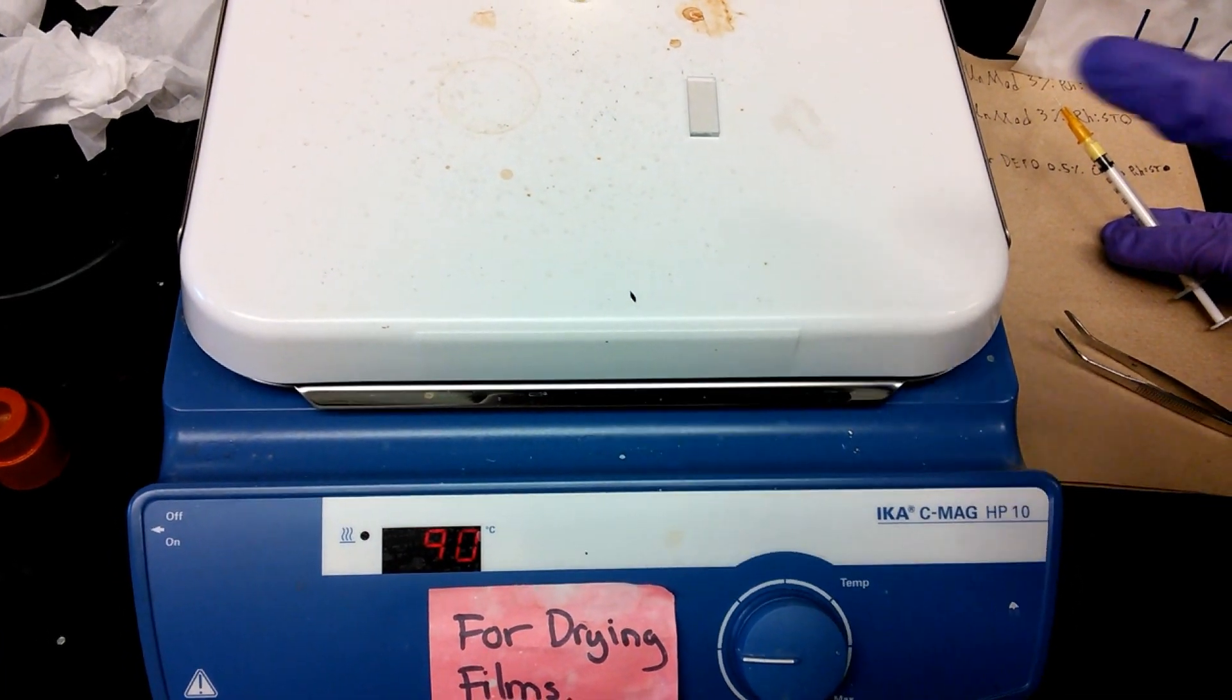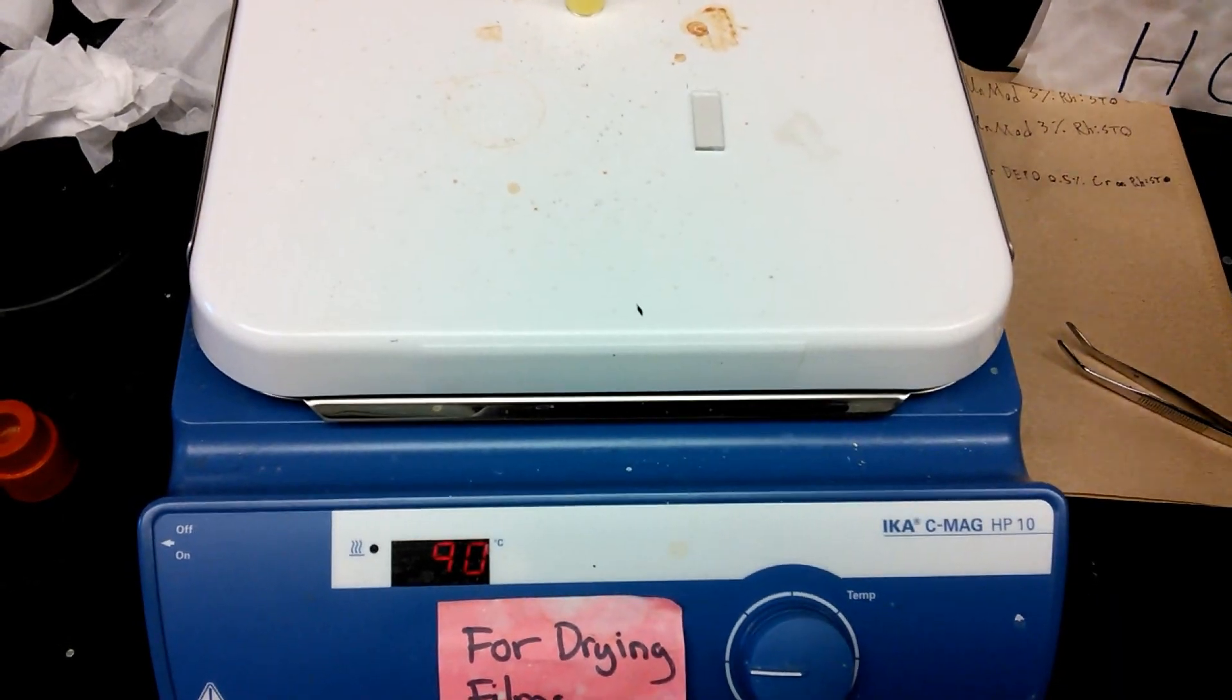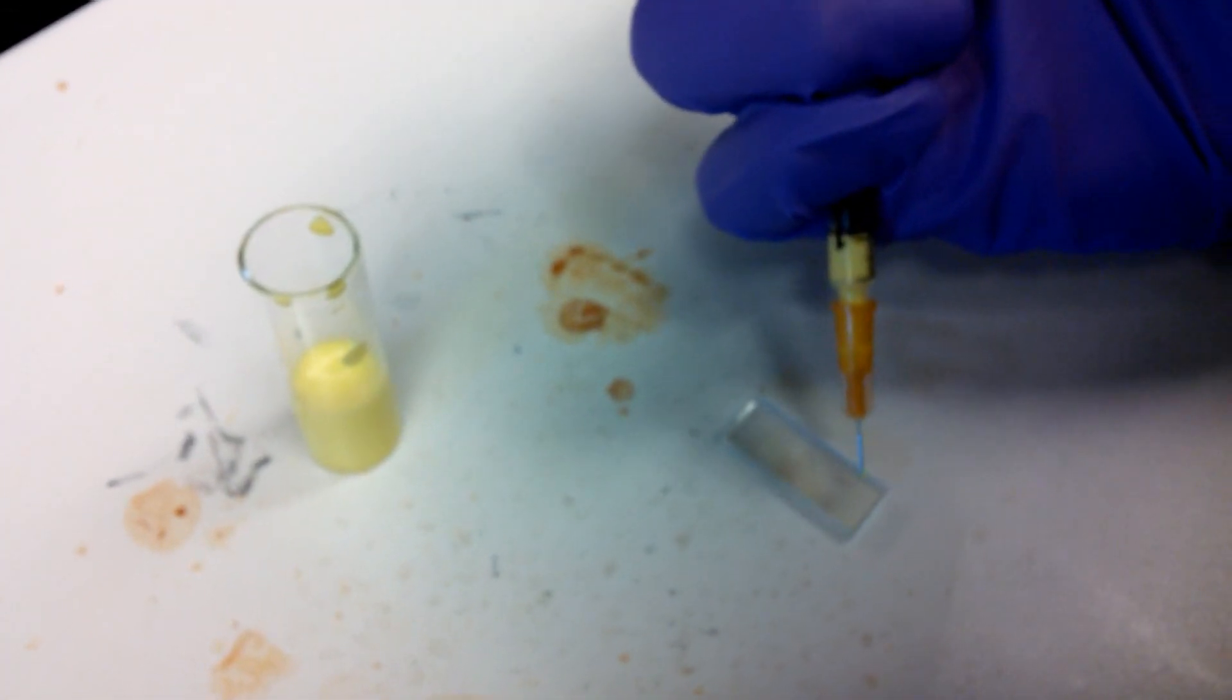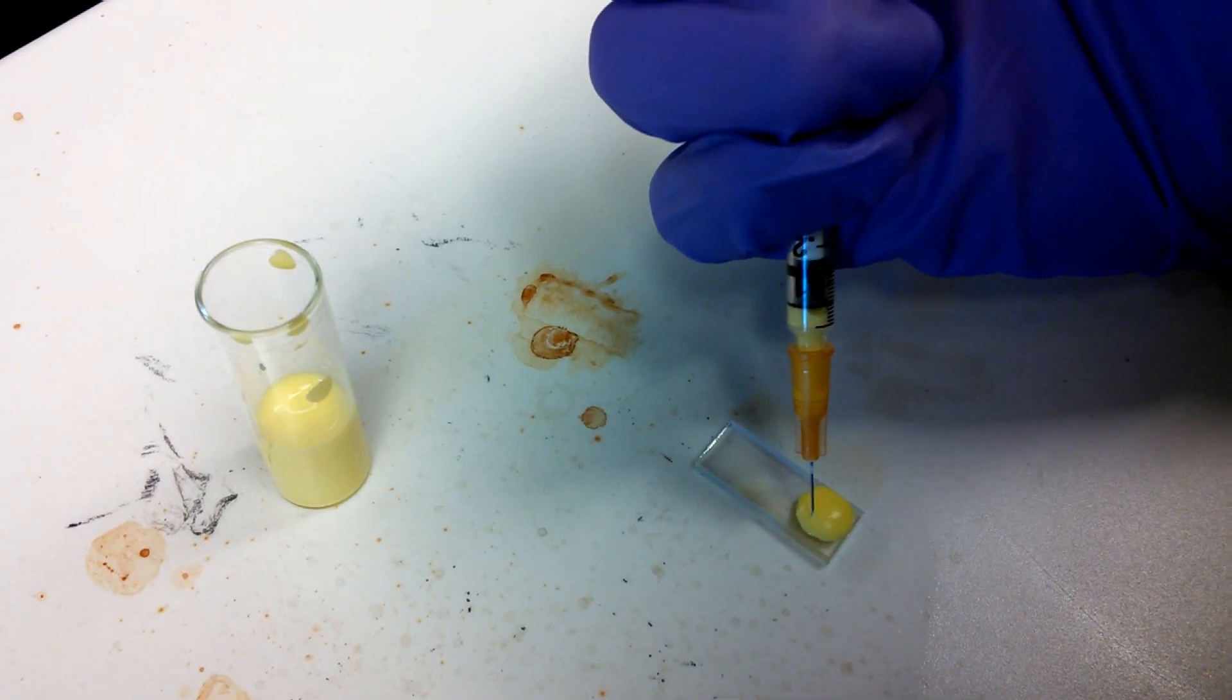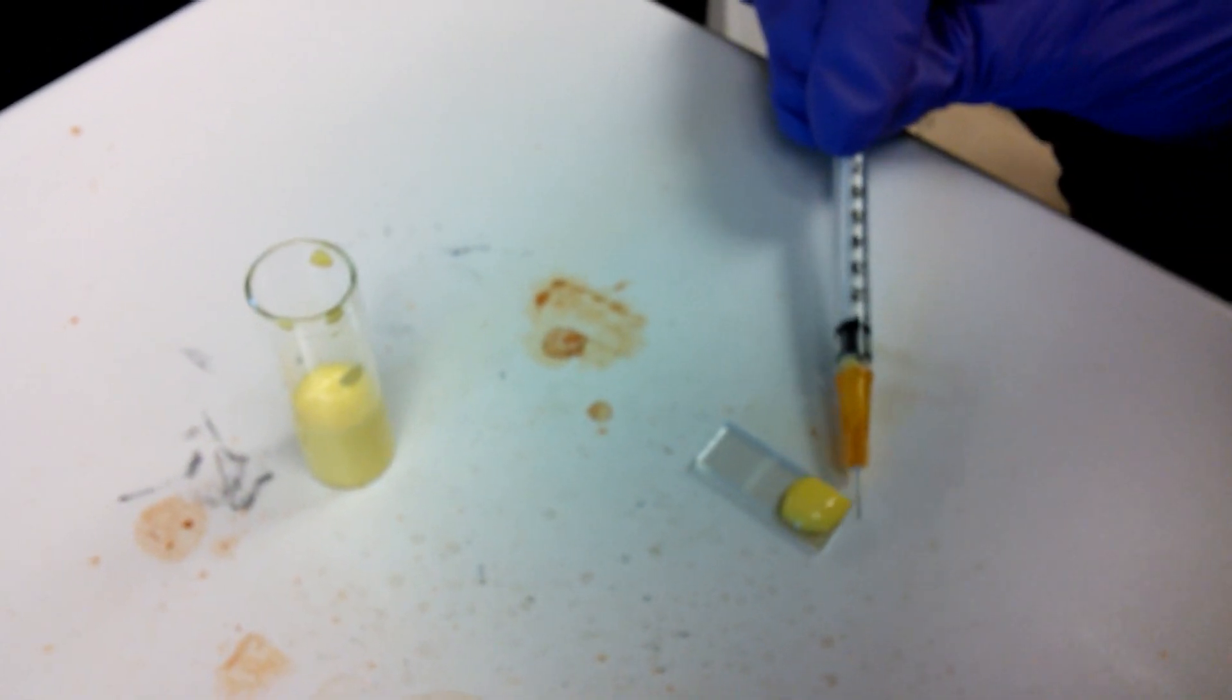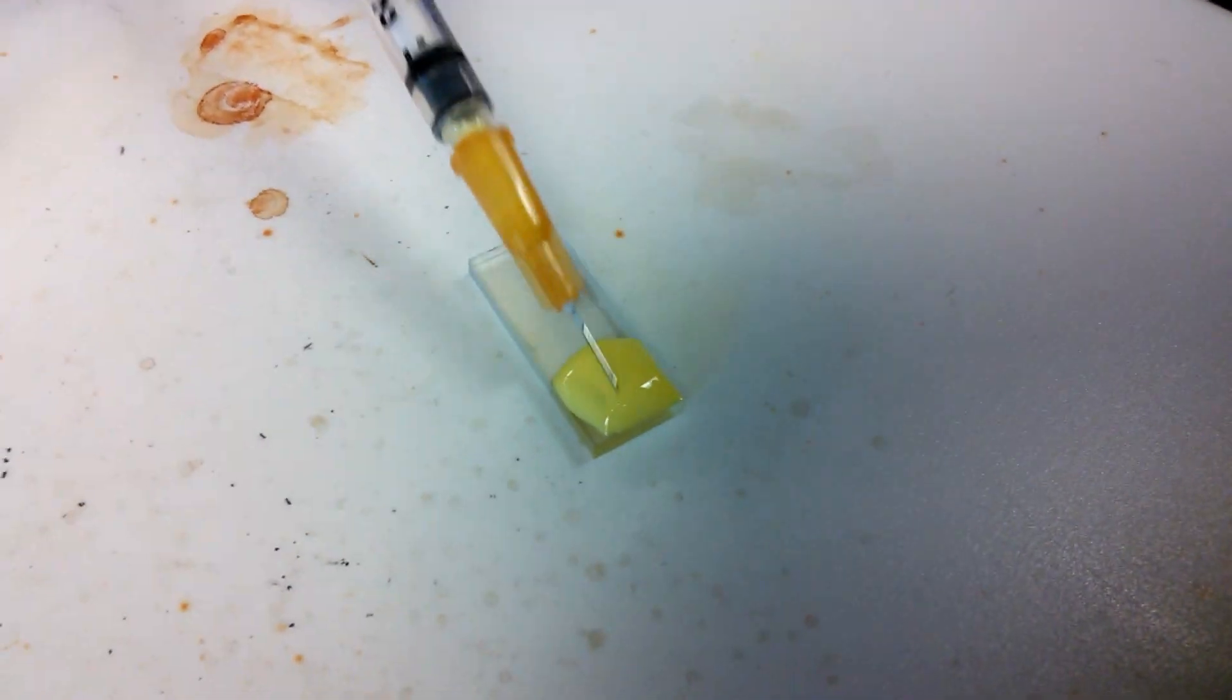To make our films, we preheat the substrate to approximately 90 degrees Celsius and then use a syringe to apply a desired amount of our suspension to the substrate. The syringe can then be used to spread out the suspension to cover the desired area of the substrate.